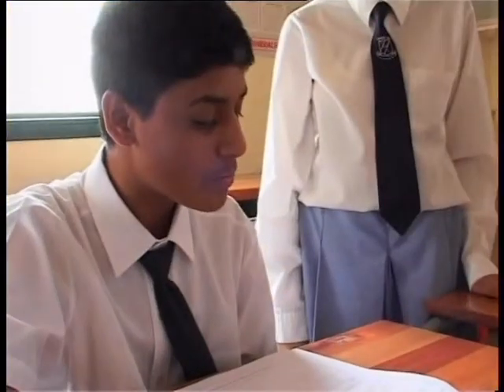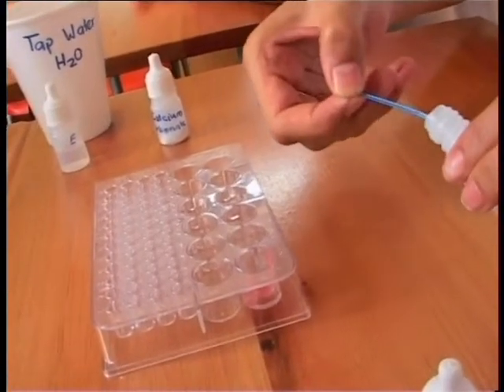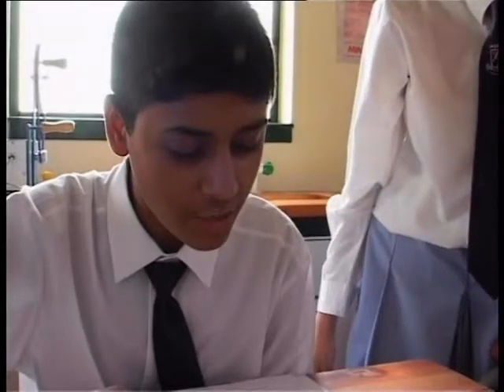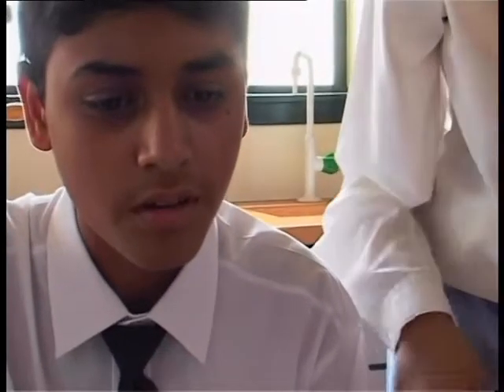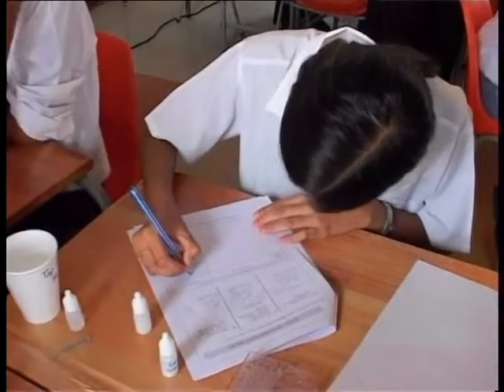Put 3 microspatulas of substance A into well F. Add 3 microspatulas of powdered calcium carbonate. Stir with a toothpick to mix the solids thoroughly. Record the observations in the table below. There's no reaction taking place.